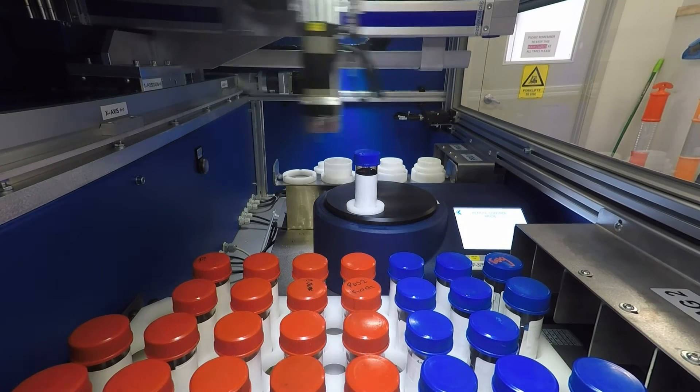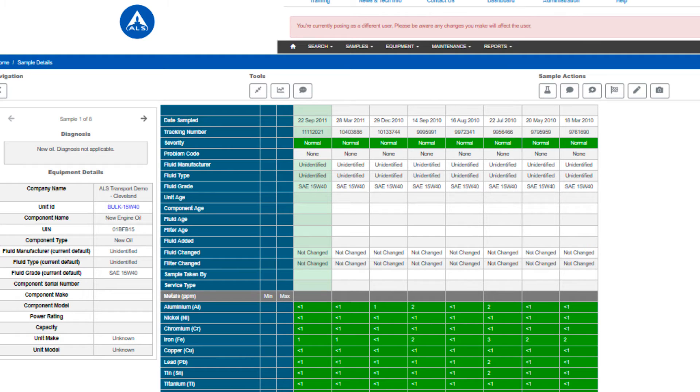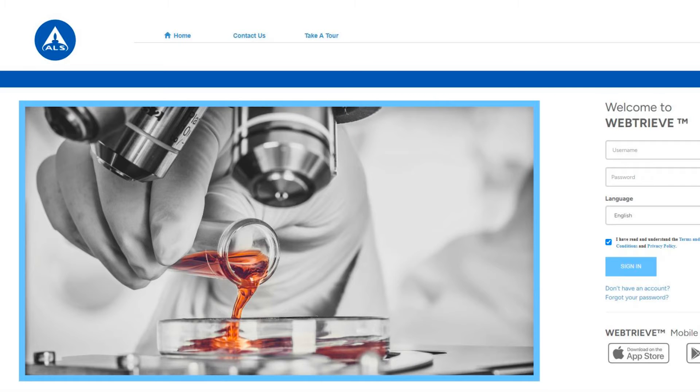Samples received with barcodes generated from WebTree or submitted through the mobile app are scanned and quickly moved into the laboratory for processing. The final report is sent to the recipient. It can be accessed through our mobile app, the WebTree website, or via email.